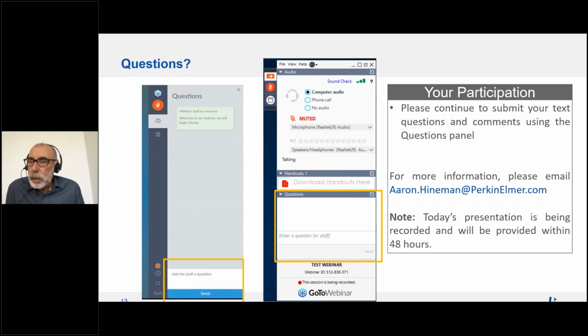And we have used this BCR reference material that is certified for size, but it also includes the number concentration. It's not certified, but we have the recommended value.